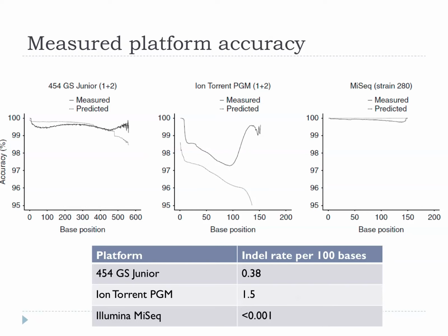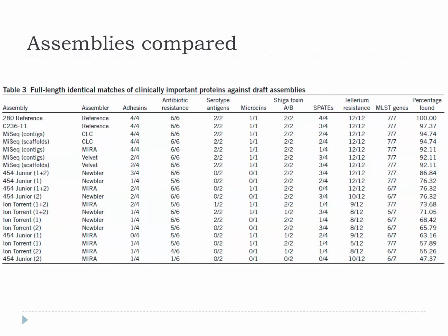And it's a problem with these kind of flow-based technologies. So 454 also has a problem here, but it turned out the Ion Torrent had it even worse. And so where, say, you have 8 A's in a row, the platform can't tell you whether there's 7 A's, 8 A's, 9 A's. It's just not very accurate at that.